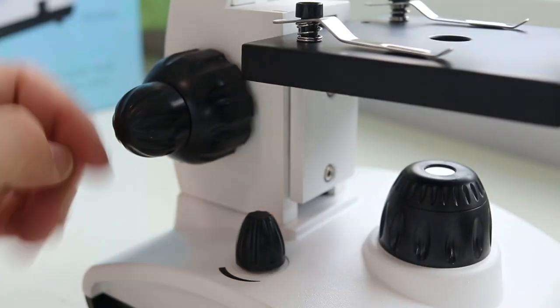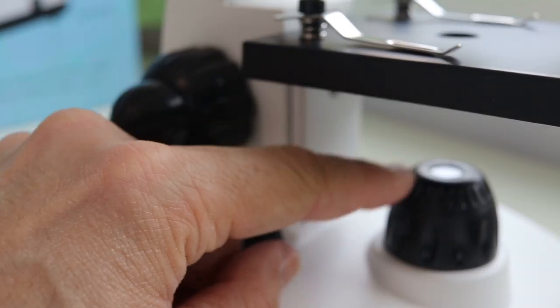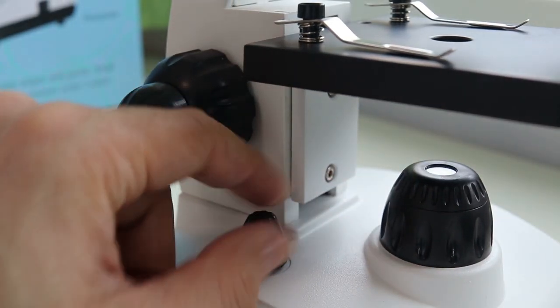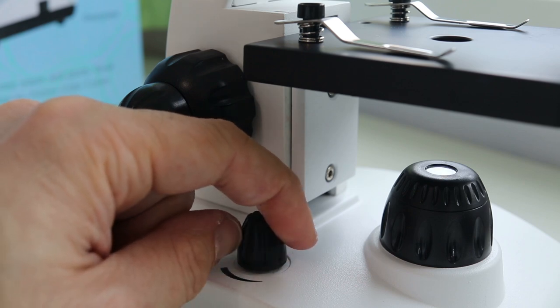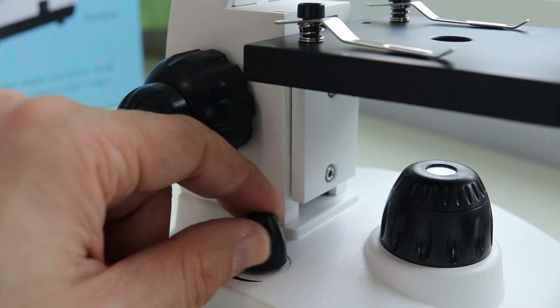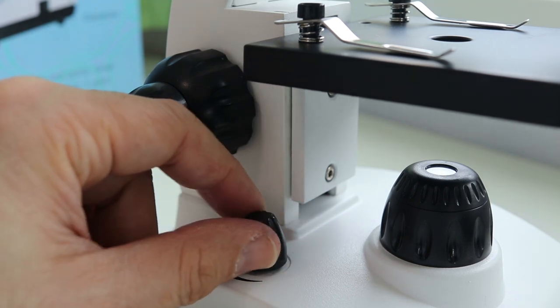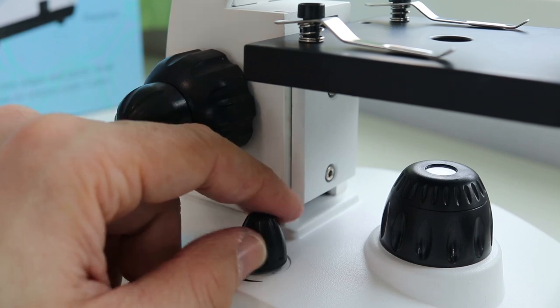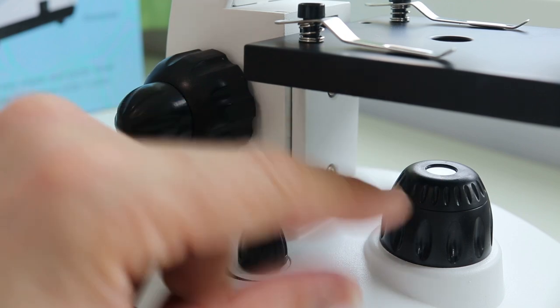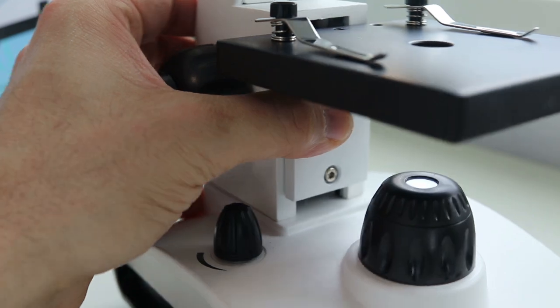There is, however, one thing that I need to say. When you turn it on, I do not know if you can see it quite well or not, but the response is not very linear. This means the LED kind of jumps a little bit in brightness. The reason is that LEDs generally have a non-linear response. If you want a continuous response, you have to add some electronics to the microscope, which I think is not necessary and would simply make it more expensive.